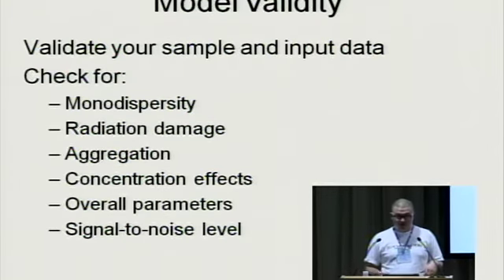And once there was a problem with the shutter. The shutter wouldn't open, so there would be no X-rays, but the detector would collect some background noise. And then this noise would be subtracted from another noise, which was the measurement of the buffer, resulting in noise again.